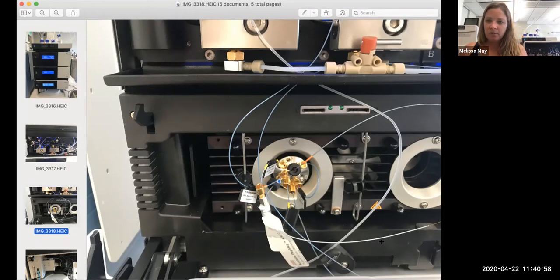If I switch these valves to the 10-1 arrangement, what happens is it switches the flow of everything. And so if we switch that arrangement, now we're going in this direction. And so sample coming from the autosampler up is going to go into our trap column. It's gonna come down and meet with this valve that is bringing in our solvents A and B, so our liquid and mobile phase, and be injected onto the column, okay? And so by controlling those valve positions, we can control what is moving in or out of the instrument at any given time.